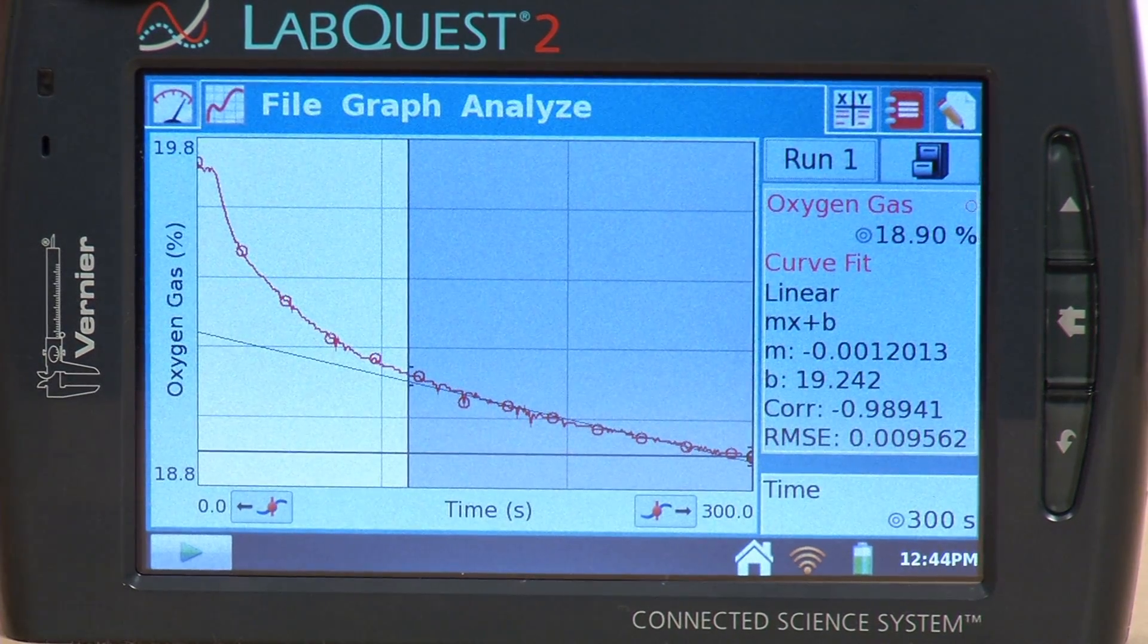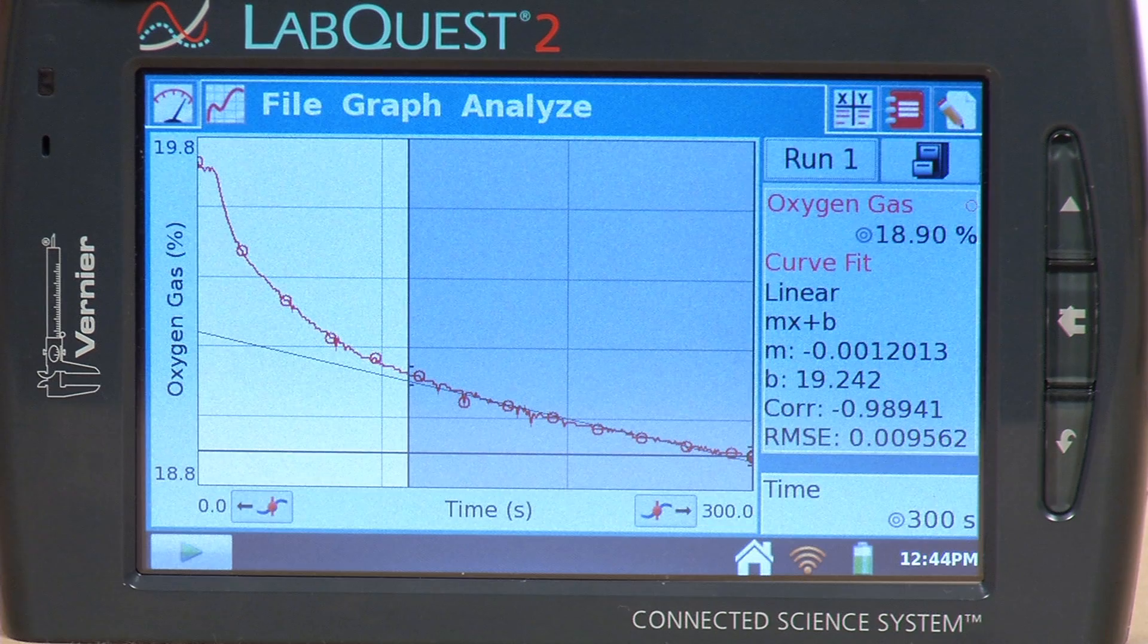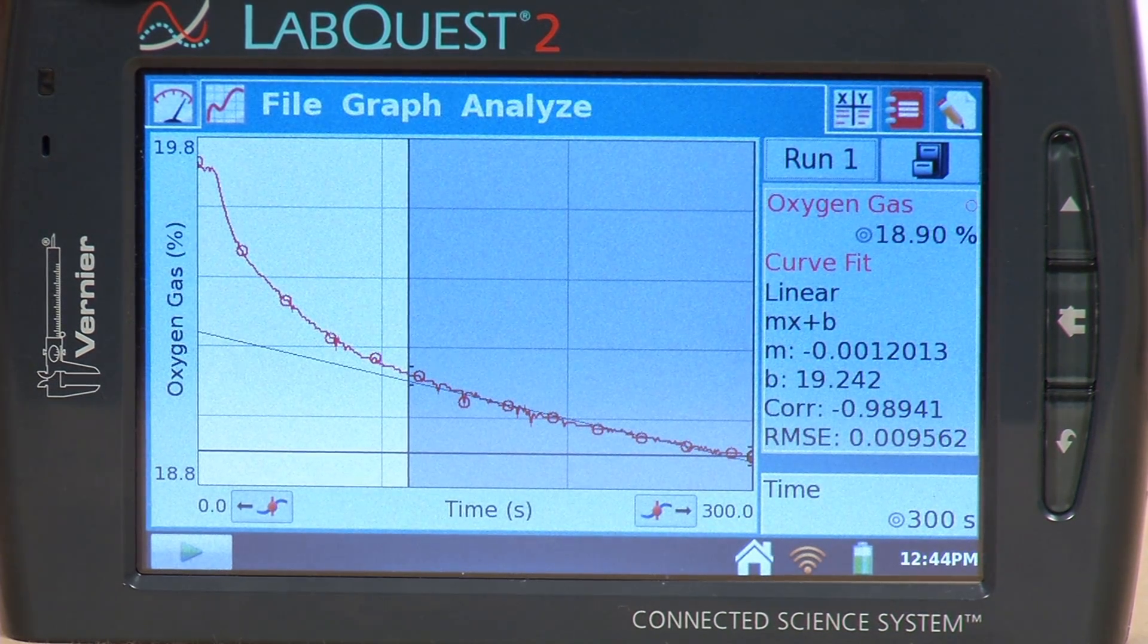And so the slope of that section is displayed there. So it's telling me what the rate of change is for that piece of the graph.